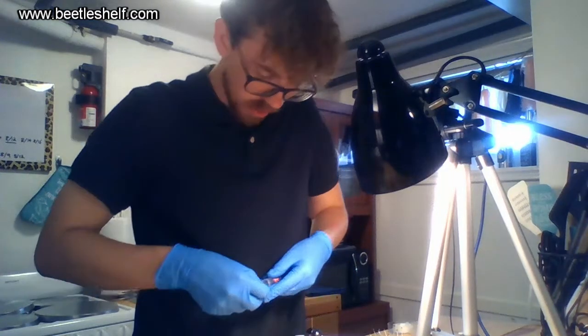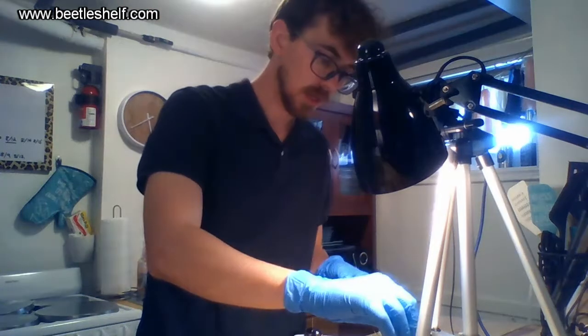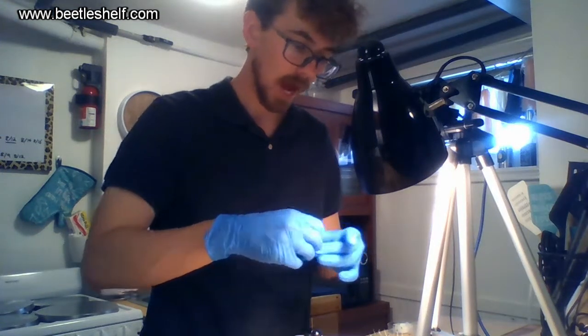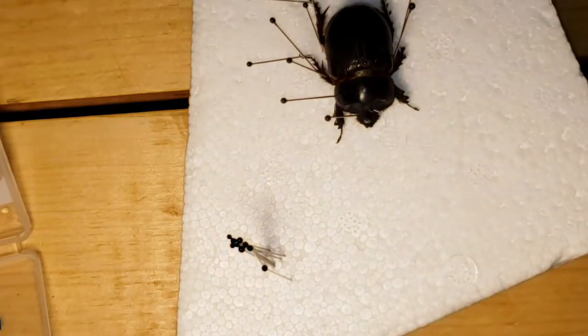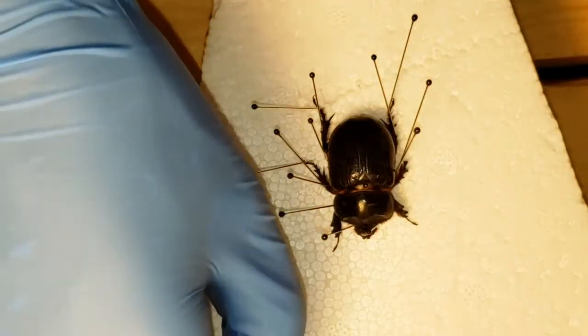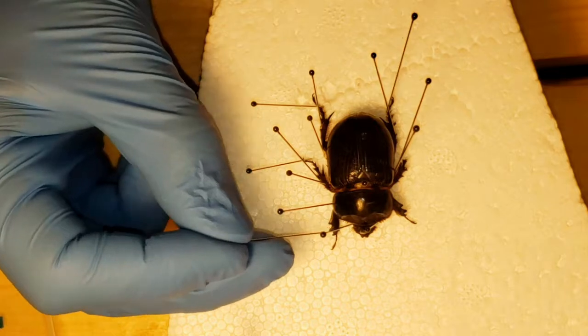You're able to pin with little map pins if you're really on a budget, but I highly recommend getting these nice insect pins — very worth it, very easy to use, and they're very sharp and go through even this hard insect casing.